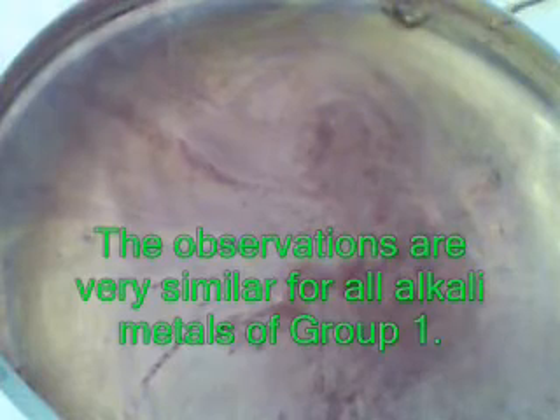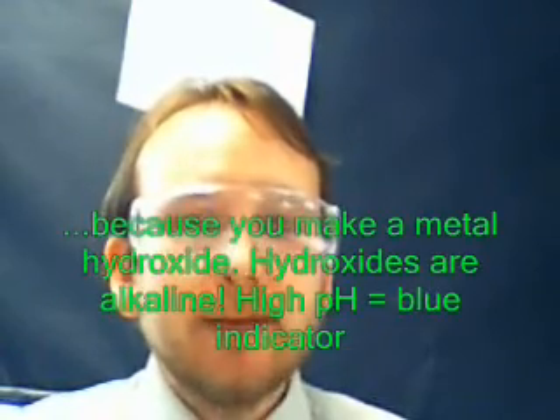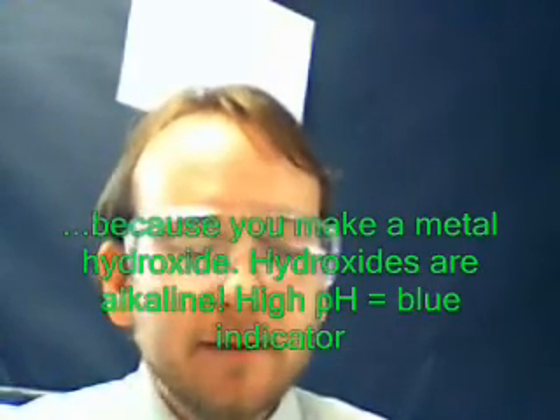One last time — whoa! There's quite a lot of smoke here as well. So, what are the observations we could make? Firstly, sodium, lithium, and potassium — all three of them floated in water, which means they must be less dense than the water. They float on the surface, they're less dense, they form into a ball. They generate fizzing or bubbling — there's a gas evolved. They turn water with universal indicator in it blue, which is a dead giveaway that the solution is alkaline. And they zoom around the surface and eventually react and disappear because they get used up.